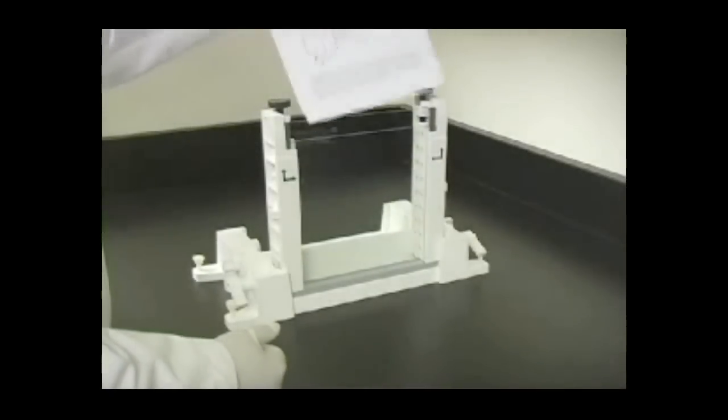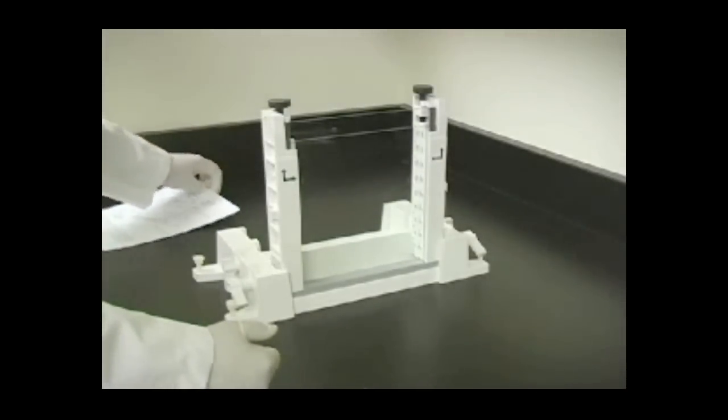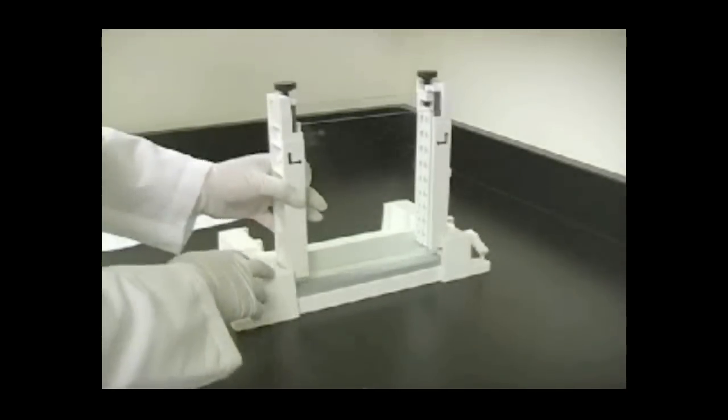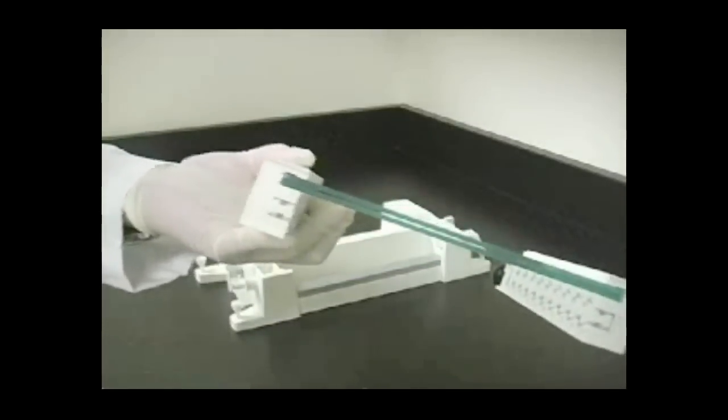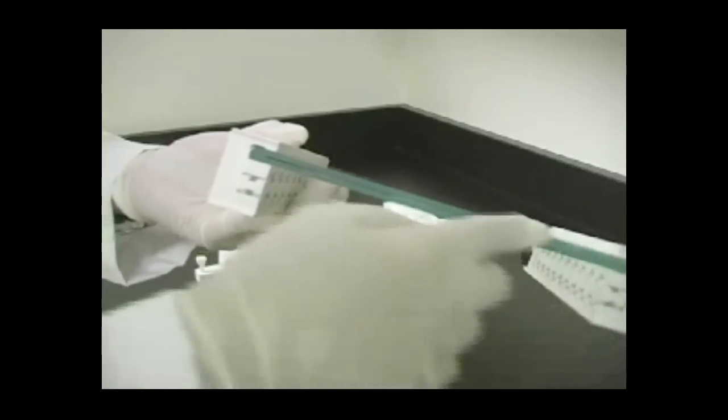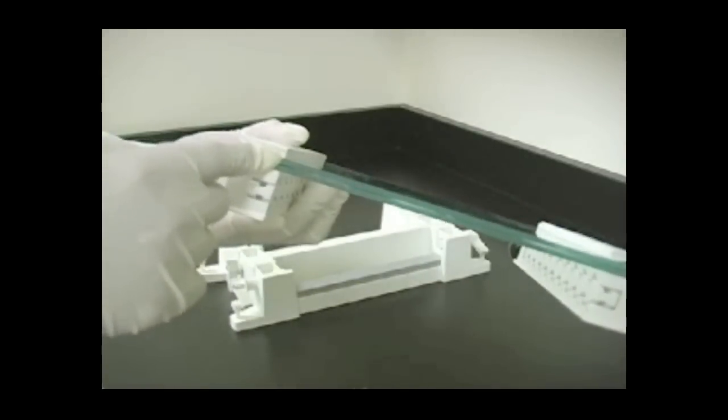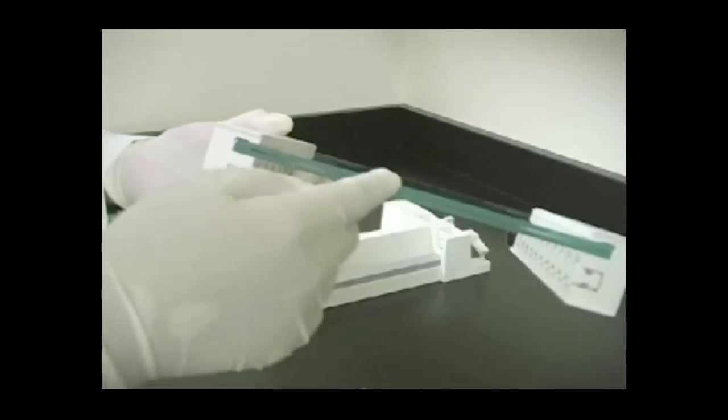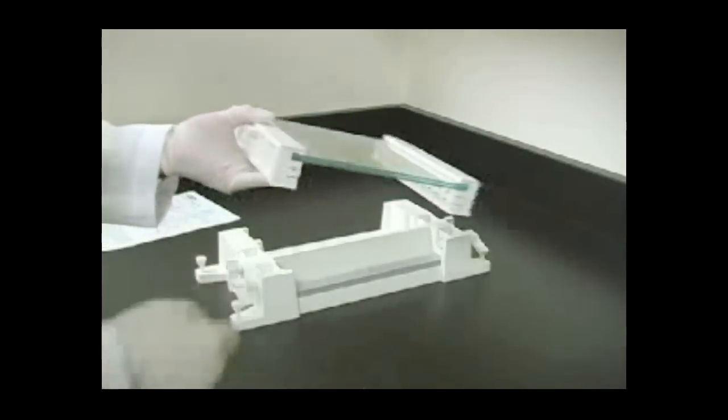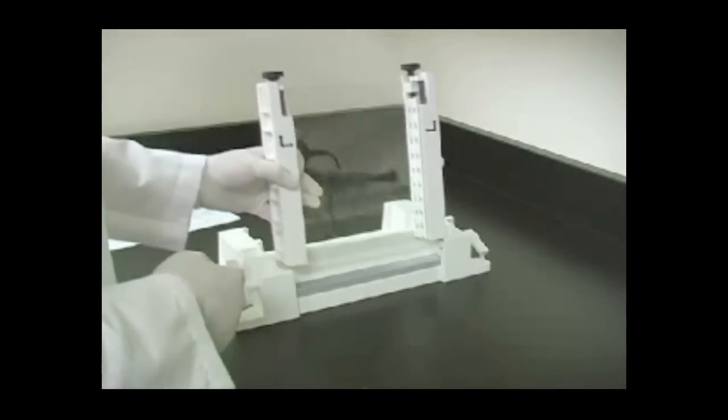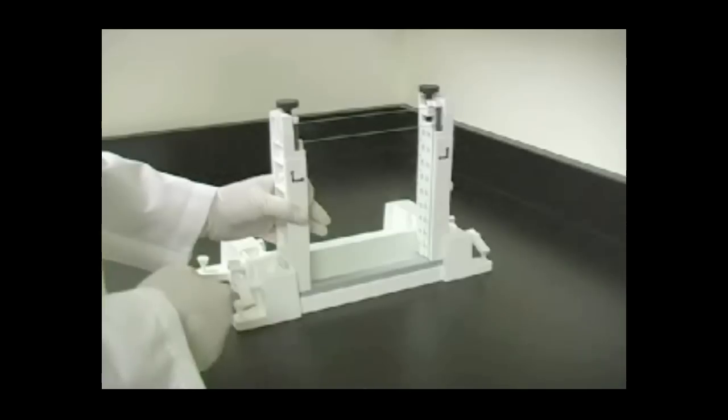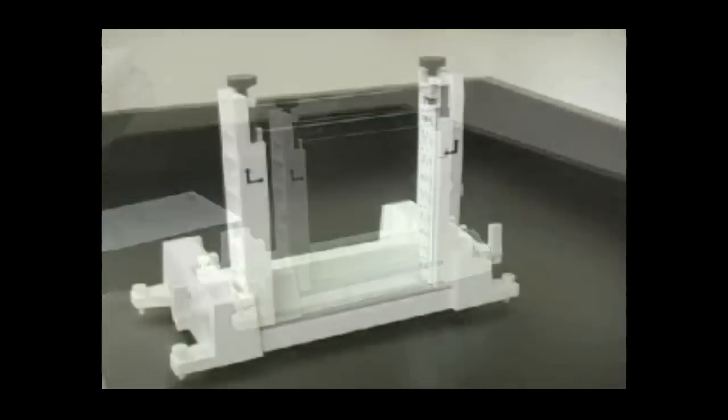Remove the alignment card. Pull the sandwich from the casting slot and check that the plates and spacers are flush at the bottom by running your fingers across the contact area between the glass plates and spacers. You should not feel any indentations. If you do, you must realign the sandwich again. Place the sandwich back in the casting slot, short plate facing outwards.